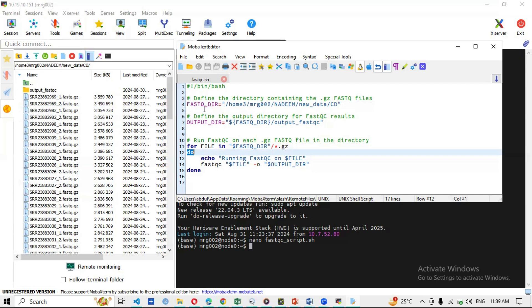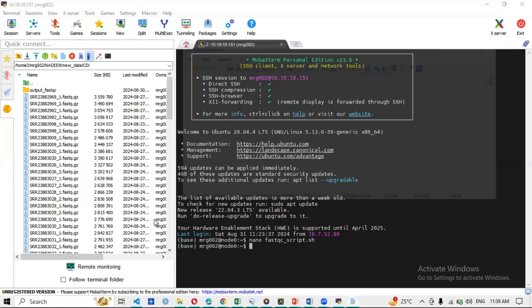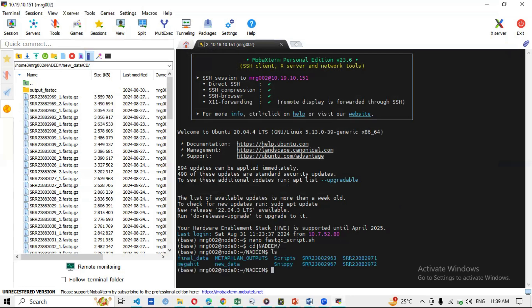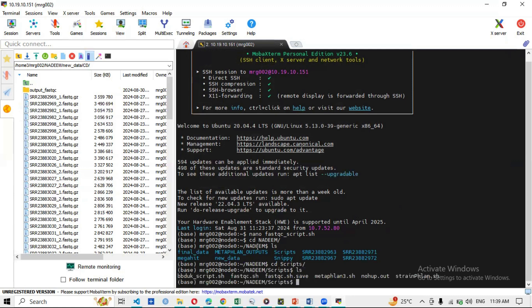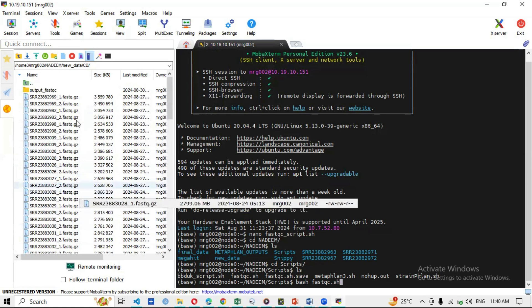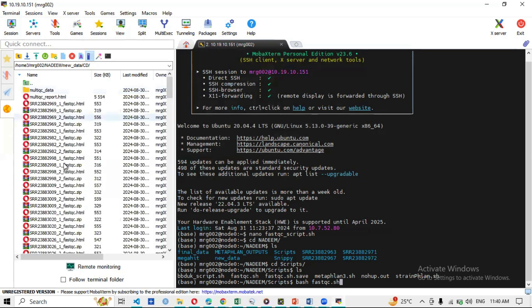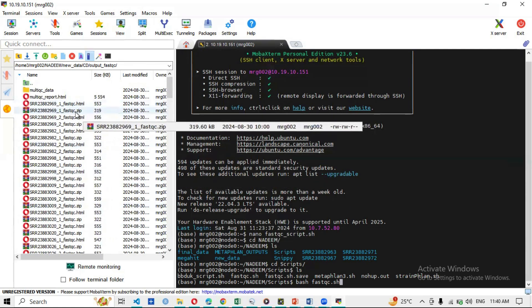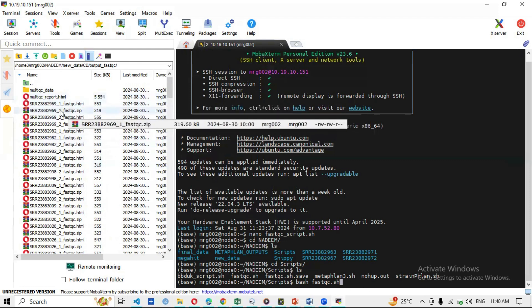So the complete script defines the fastq directory and output directory, runs a for loop over all '.gz' files, echoes progress, calls FastQC with the output flag, and ends with 'done'. After saving, I navigate to the scripts folder and execute it with 'bash fastqc.sh'. It starts processing all files. The output consists of HTML reports and zip archives for each sequencing file.